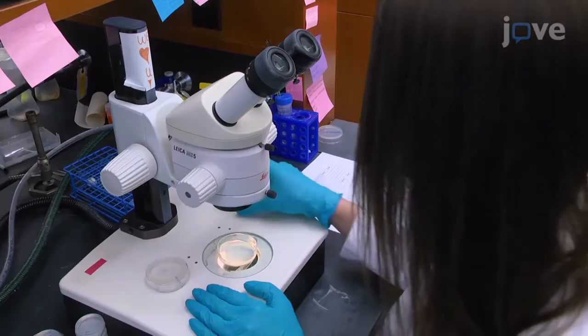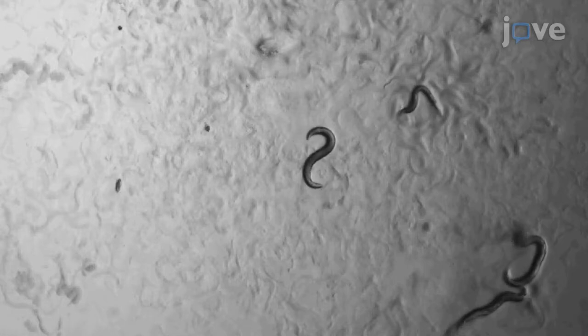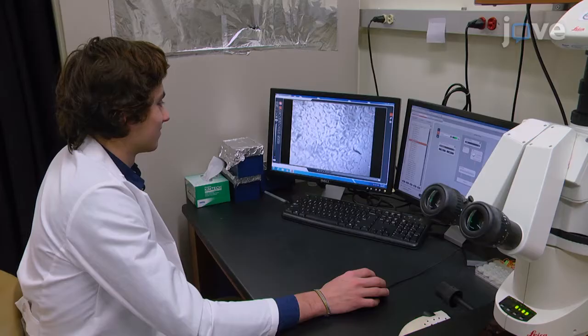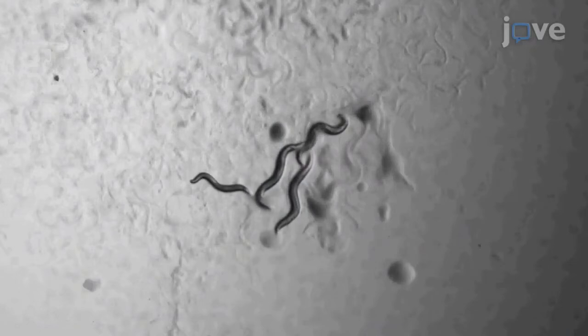RAN peptides are a feature of repeat expansion neurodegenerative disorders, such as Huntington's disease, amyotrophic lateral sclerosis, and frontotemporal dementia. These protocols provide an important standardized approach for quantifying RAN peptide toxicity in the C. elegans model system. The techniques described are simple to learn and inexpensive, can be performed quickly, and leverage the reproducible features of the C. elegans system such as movement and reproduction.